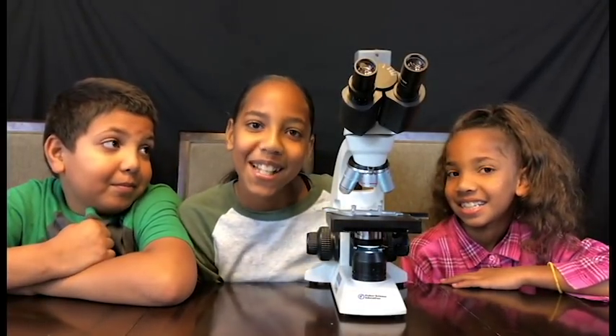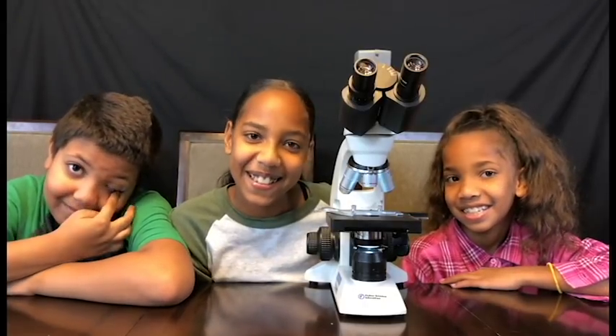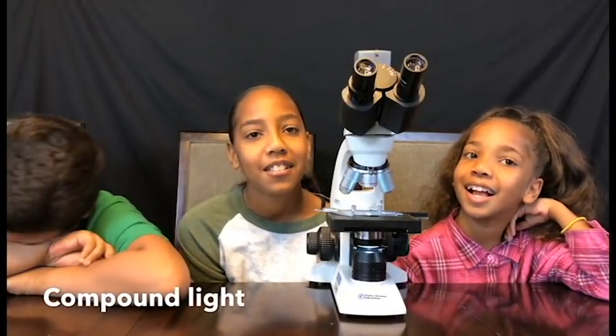My mom is going to be saying a few things to tell us more details. So do you know what type of microscope that is? It's a compound light microscope — this one is binocular. We have all kinds of microscopes. There's phase contrast, there's dark field, all kinds of things, but this one is a compound light microscope.